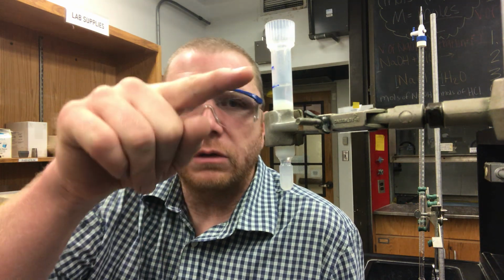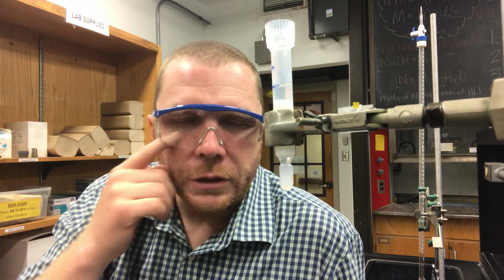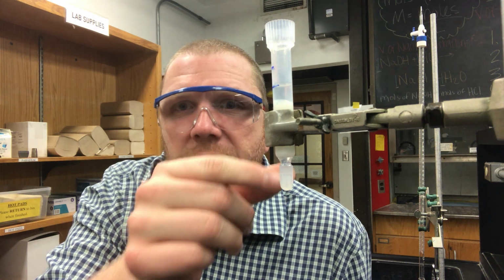Whenever you get your column, the first thing that you are going to do is add your protein sample to that column so that then you can get the ball rolling on eluting your protein from this sample. Now the next thing that you want to do is, as soon as you add your protein fraction, you're going to be on the bottom side of this collecting fractions. We're going to be using glass test tubes to collect approximately 1 milliliter per test tube for each fraction.